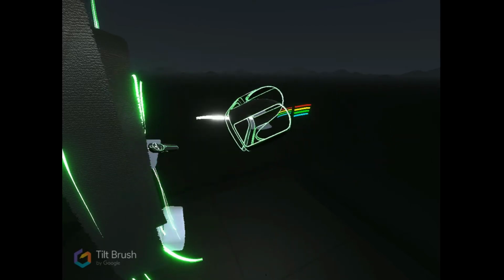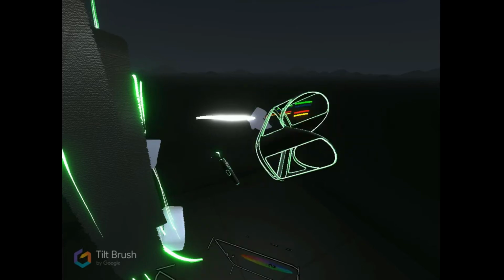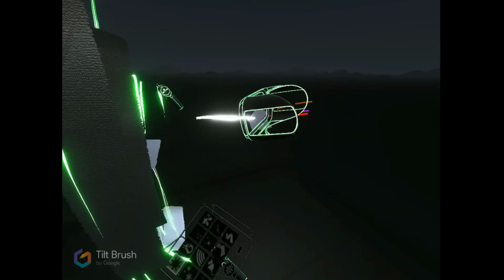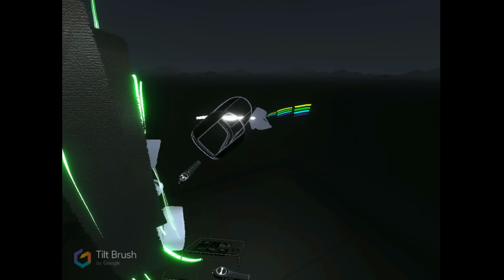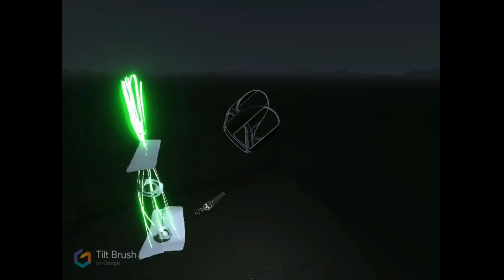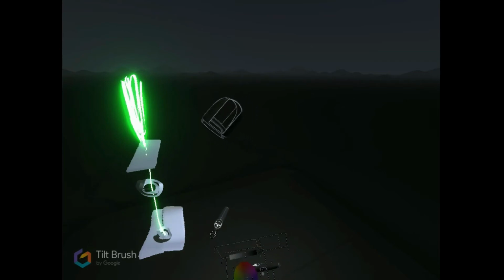Because of all that space, that's why you'll have the dot that's straight down under the beam be your biggest spot. Because normally in the TEM we have an aperture here that blocks out all these other spots. So we're left with just this spot in the middle. So you have these apertures, and what they'll do is they'll remove all of these other spots, so you're left with just that one.